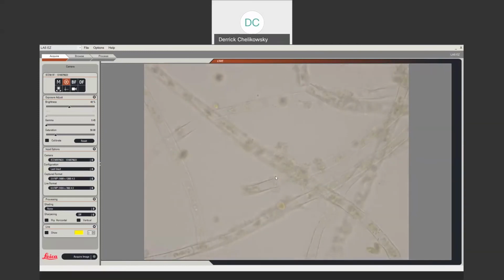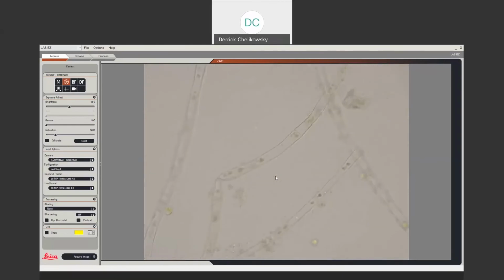Actually, this is very good. It's like most of the cells have moved into their next stage of life. We can look at some of these chains here. Okay, here we go. Here's one. Here's one. This is at 40 times. You can see right here that this is one of the cells with chloroplasts inside of it. We're also going to take a picture of that.